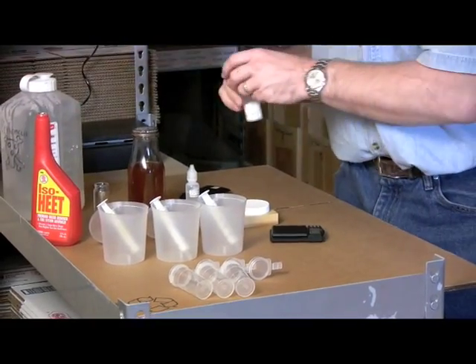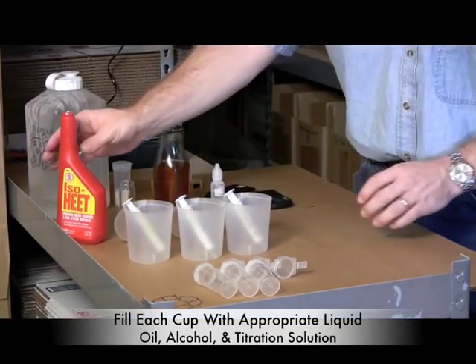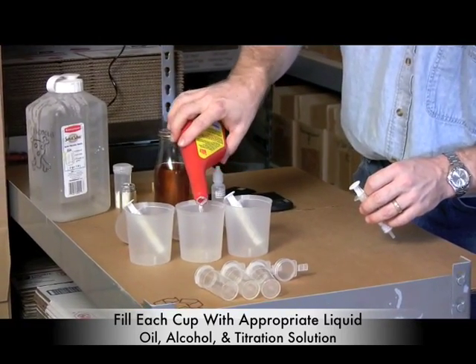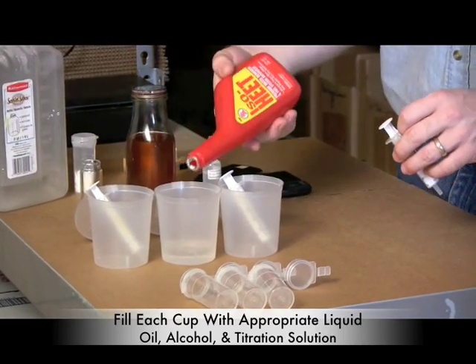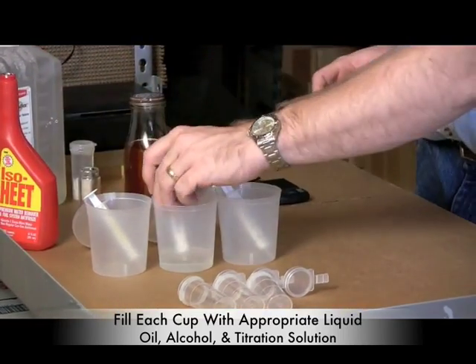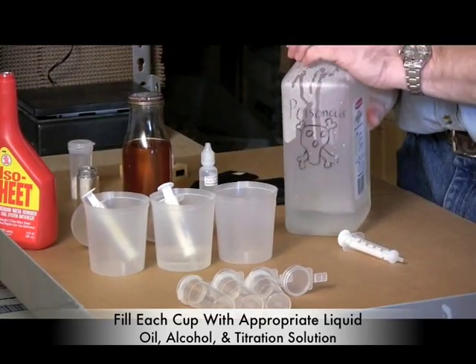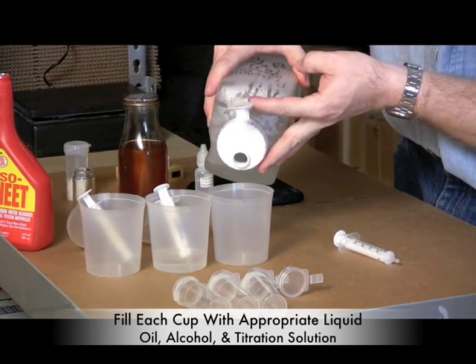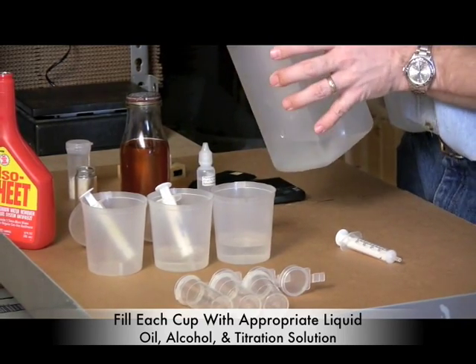Once that solution is ready, pour some alcohol into one of your cups — we'll be titrating with this. Put about 30 milliliters of titration solution into your titration cup; these cups have markings on the side to help you measure. Then put a little bit of oil out to titrate with.